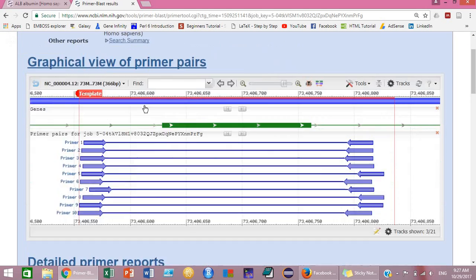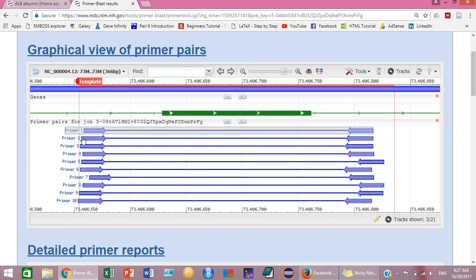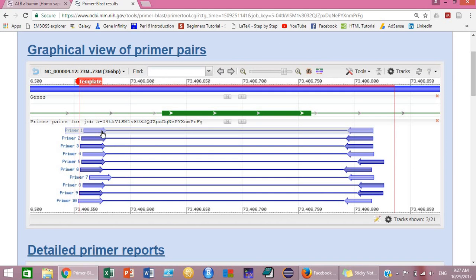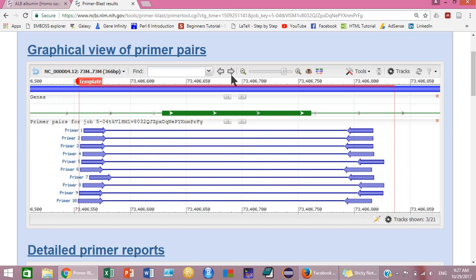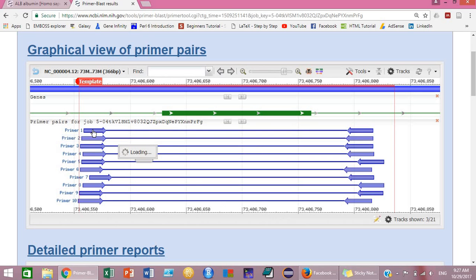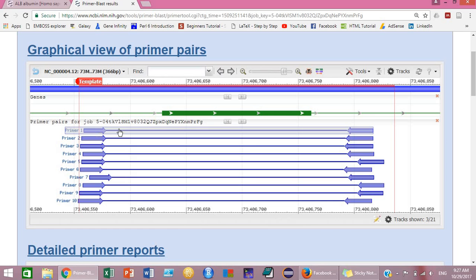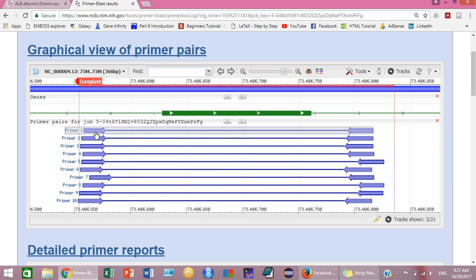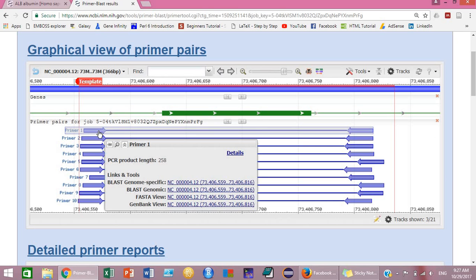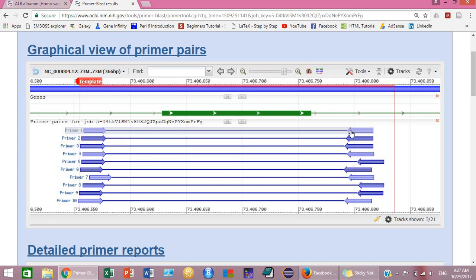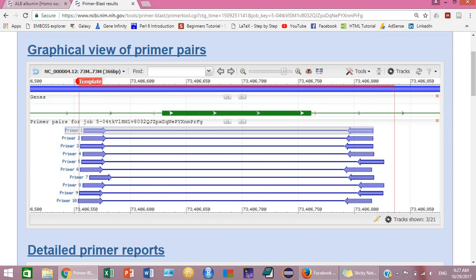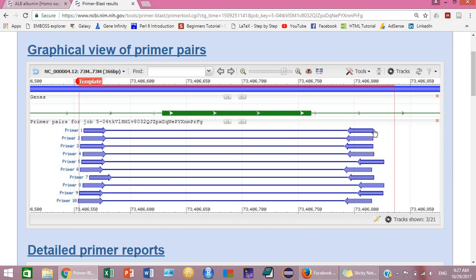So here is the list of primers designed by this tool. This is primer pair one. This graphical view shows that if we select this primer pair, our forward primer will be attached to this region while our reverse primer will be attached to this region. And the area amplified will start from the end of this primer to the end of this primer.